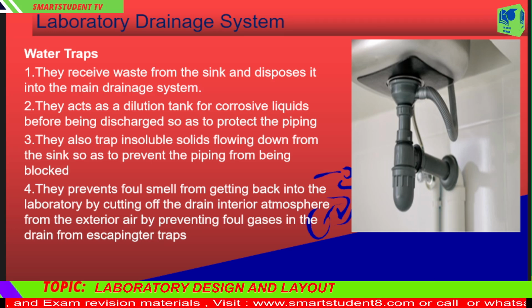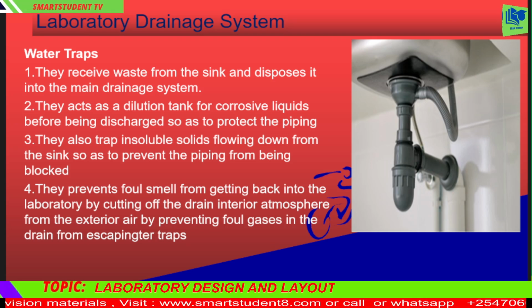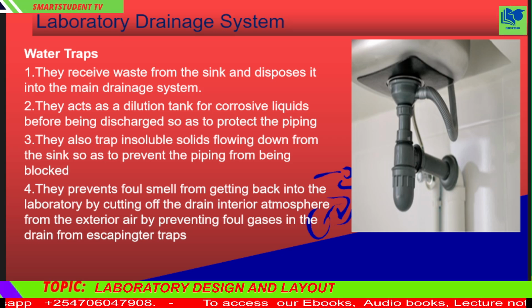1. Simple in design. 2. Accessible in all parts. 3. Made of hard, smooth, impermeable material. 4. Self-cleaning in action. 5. Be smoothly rounded with no sharp angles or corners. 6. Holding minimum amount of water but with effective seal. 7. Must not retard the flow of water. The most common materials for laboratory water traps are plastic, PVC.